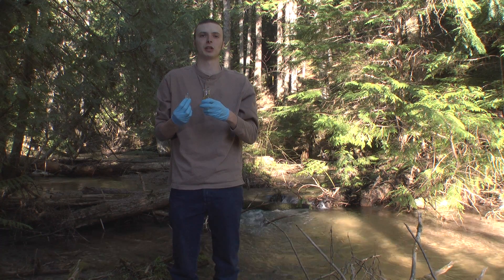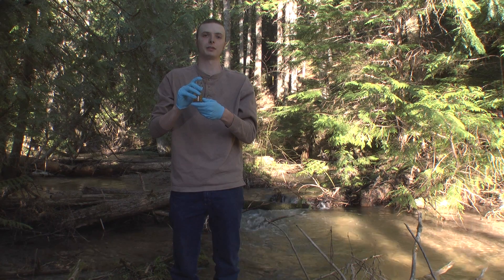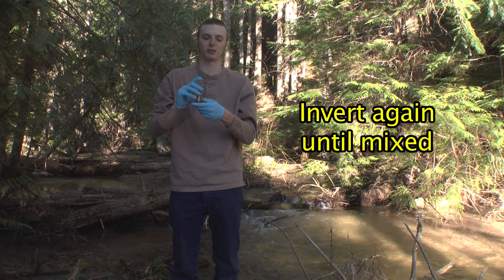Once again, when you insert the stopper into your bottle, try to eliminate any air bubbles that you can. Pour off any excess that you have and invert several times to mix once again.